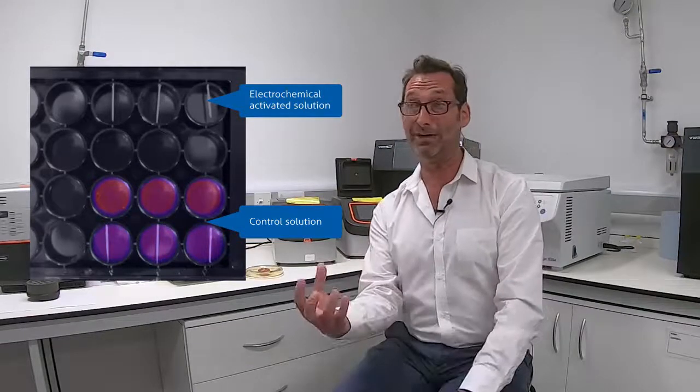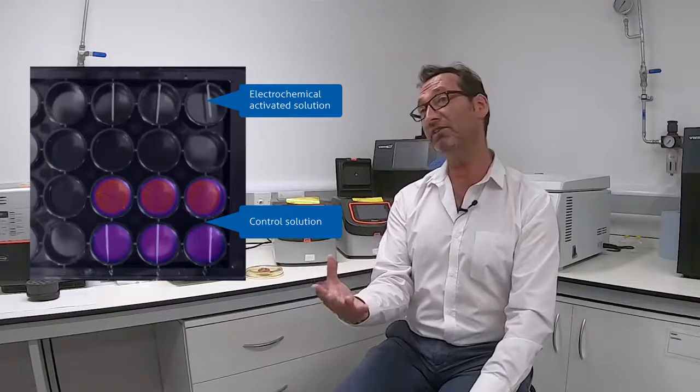What's even more interesting is that we can keep our low light cameras that detect this bioluminescence rolling. So what usefulness is that? Well, that means that we can come back the following day and see if the bacteria that we think we've disinfected has grown back.